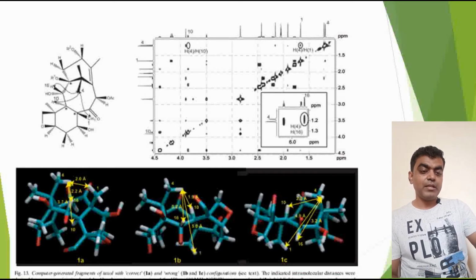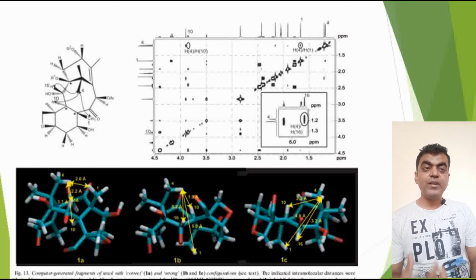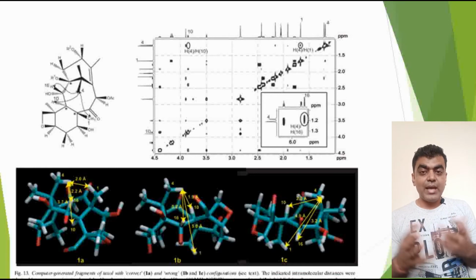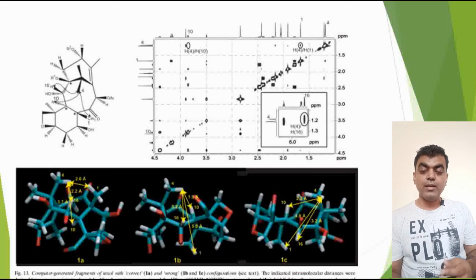Once you get the NMR spectra and you correlate it with your sample, then you see the similarity, and that is how your understanding of reading an NMR spectrum keeps on developing. A quick suggestion: when I started doing NMR, what I used to do is take a simple compound, the similar method, but I never used to reveal, or I never used to know, what particular compound I was using. I used to try to get information from the NMR and predict a model. Once I predicted the structure, I would see how close I had been to my actual sample.